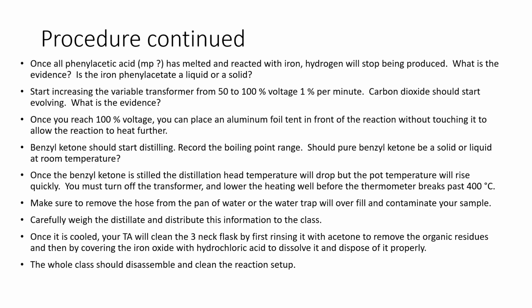And for the setup, after the experiment is done, the TA will let it cool for some time, and will then wash all the necessary equipment used here with acetone and with hydrochloric acid. Normally we use acetone to remove any organic residues, whereas we use the acid to remove any metal residues.